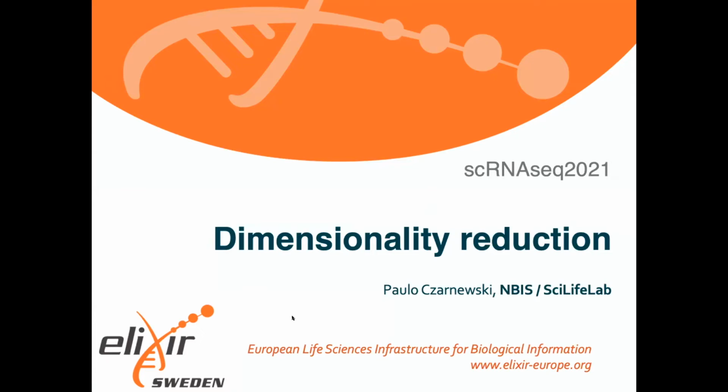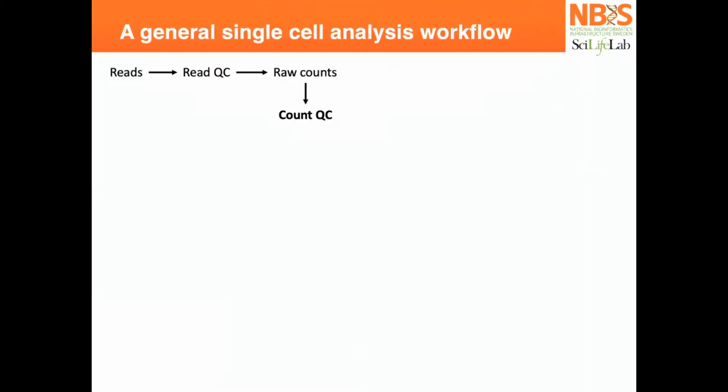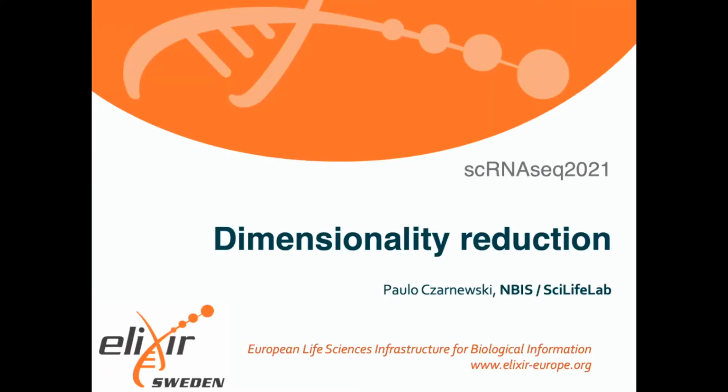Now we'll do a brief overview of the different dimensionality reduction techniques that are commonly used in single cell. There are plenty of different methods that we can introduce to you. Some of them I'll talk about right now, but there are still other methods that I'll talk about during the trajectory analysis, for example, and some of them a little bit later for the data integration.